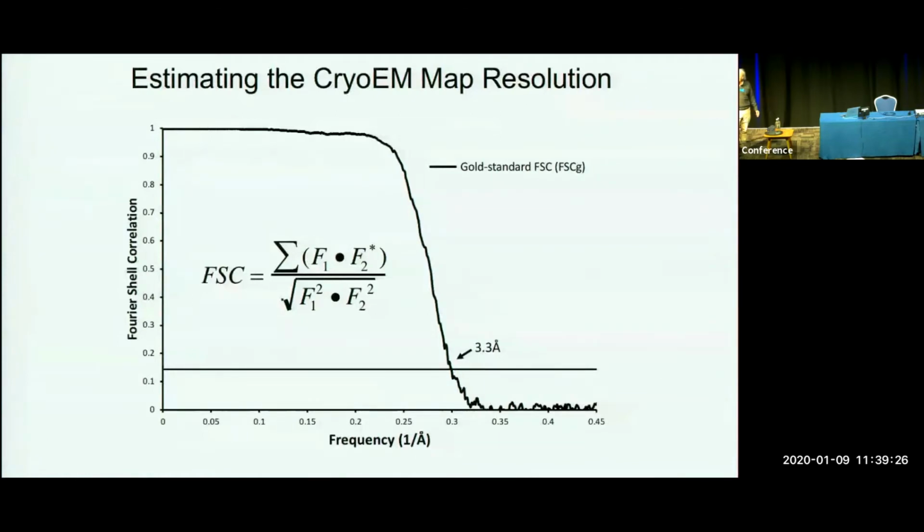Now, as pointed out in many talks, in a cryo-EM map the resolution is not uniform throughout the entire volume. Some areas are better, some are worse. So what we are now giving is 1 number. Think about 1 number used to grade a student; how dangerous it is. It's a kind of good shortcut, but it can be really misleading as well. I'm sure most Nobel laureates do not have a 4.0 grade point average, right? On average they are just smart, but they were not defined by one parameter. So we need to consider many other factors as well.